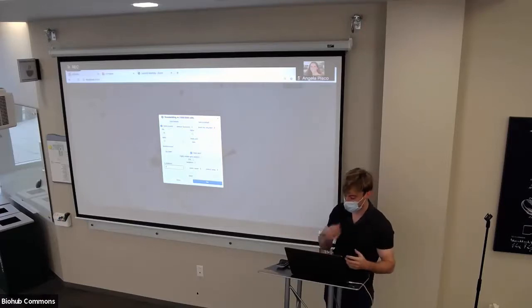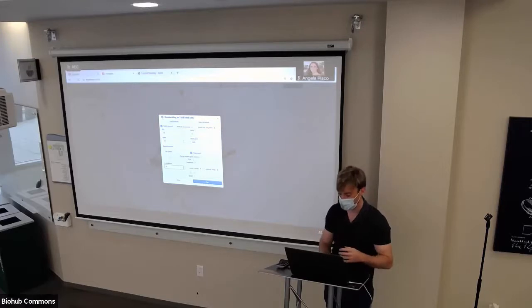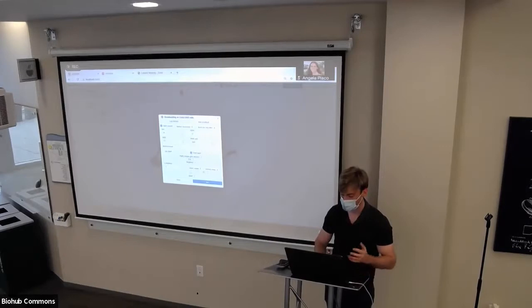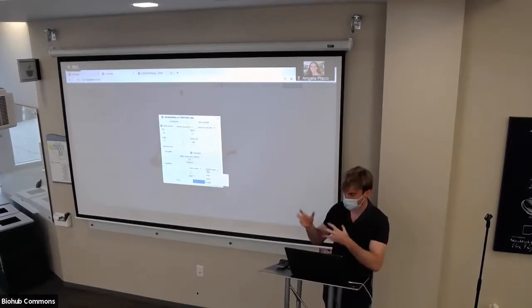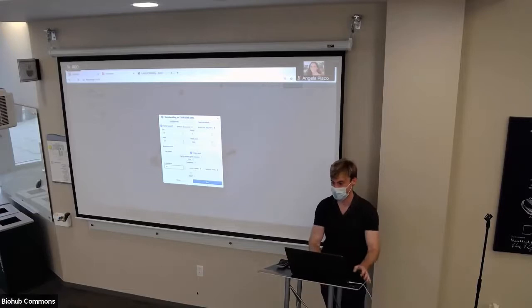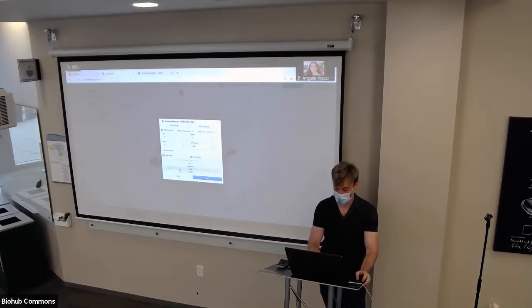These methods here on the right all try to mitigate that effect based on some fancy algorithms. But in my 5 years of working with this kind of data, I have never once touched this parameter. I never really needed to, but I'm including it for the sake of completeness. There are SAM parameters that we don't have unlocked because we're not checking it. And there's finally a UMAP parameter.